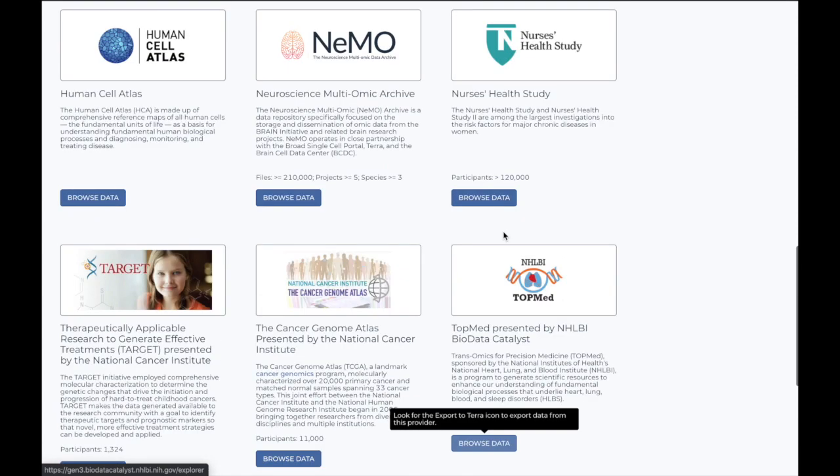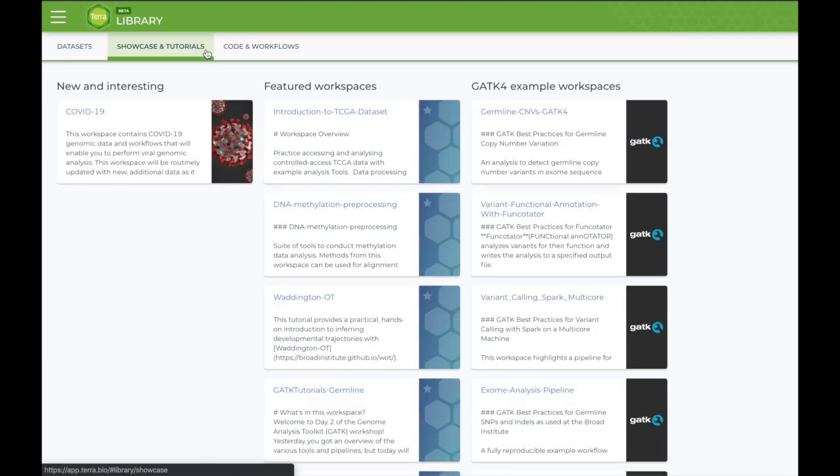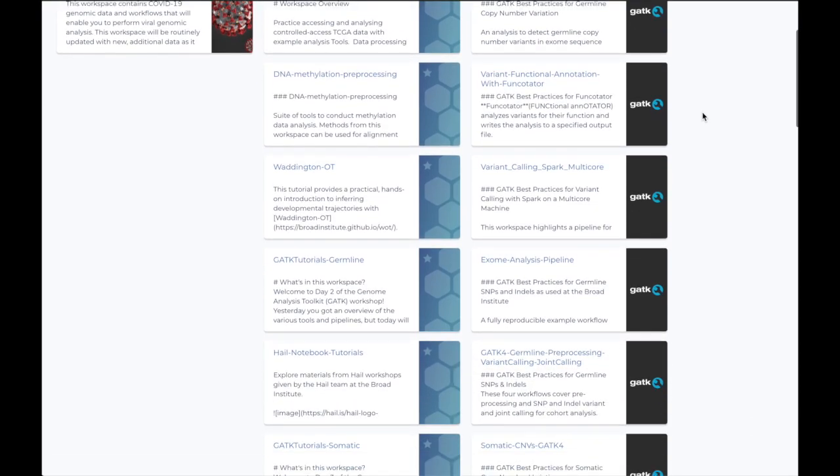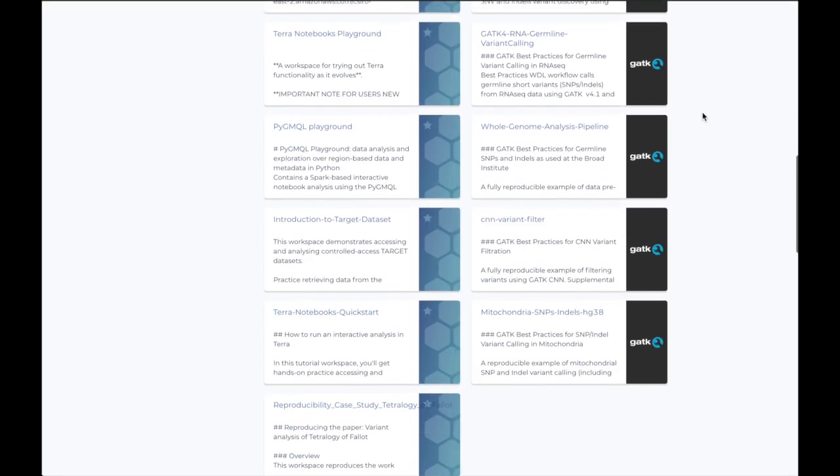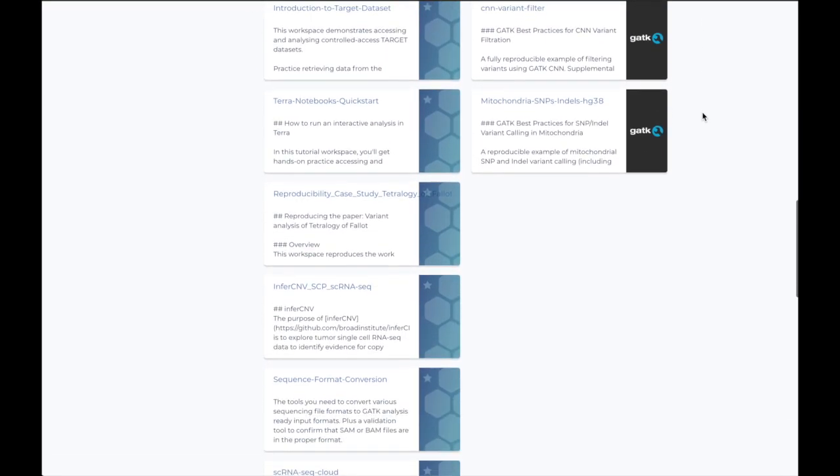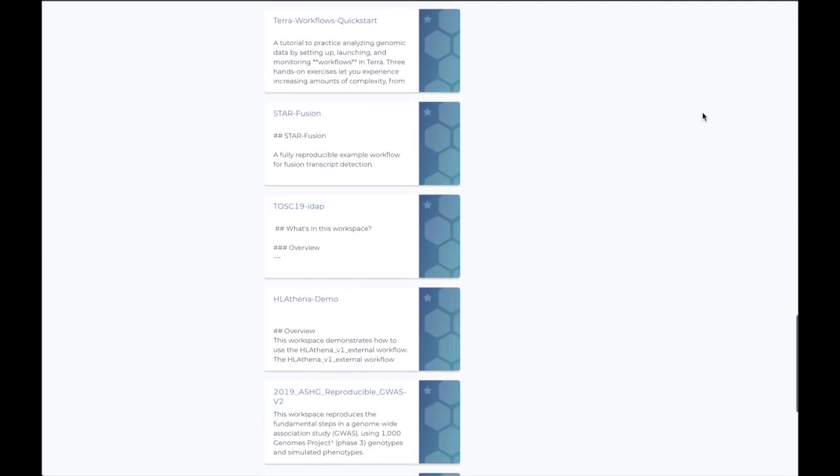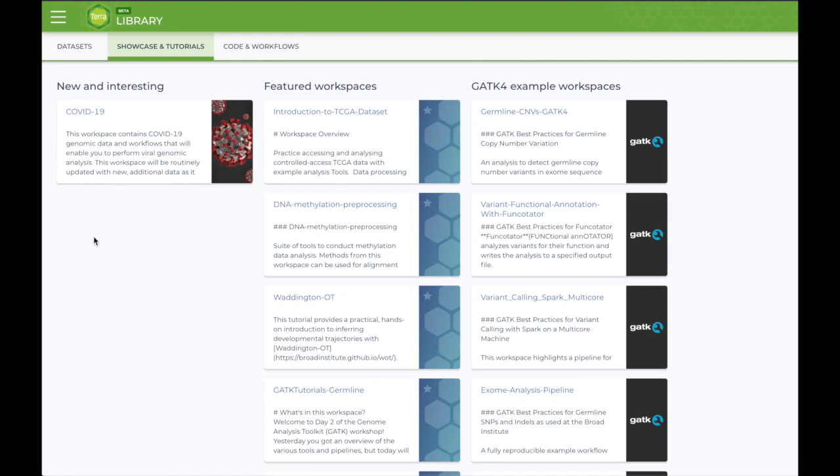In the Showcase and Tutorials tab, you can find curated sample workspaces to help you get started in Terra. This includes featured workspaces and GATK-4 example workspaces that cover a wide range of use cases. These come preloaded and pre-configured with data for you to use and explore. We will also be highlighting new and interesting workspaces here, so check back often to see what we have.